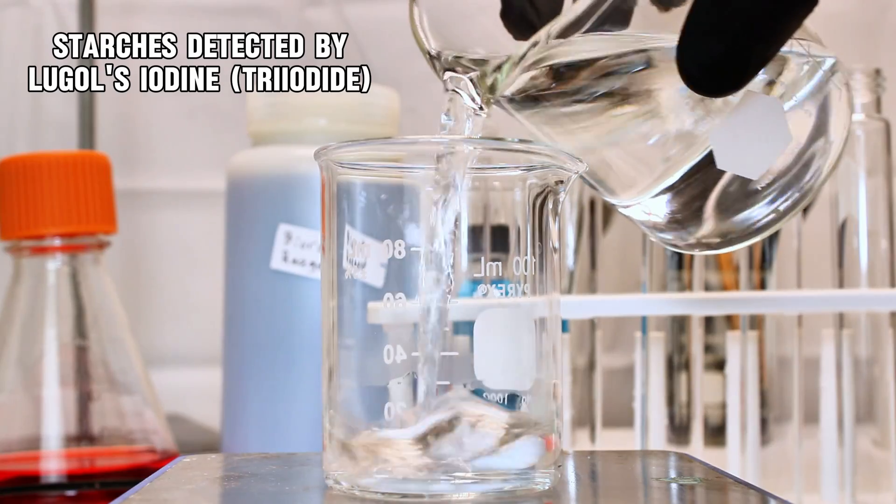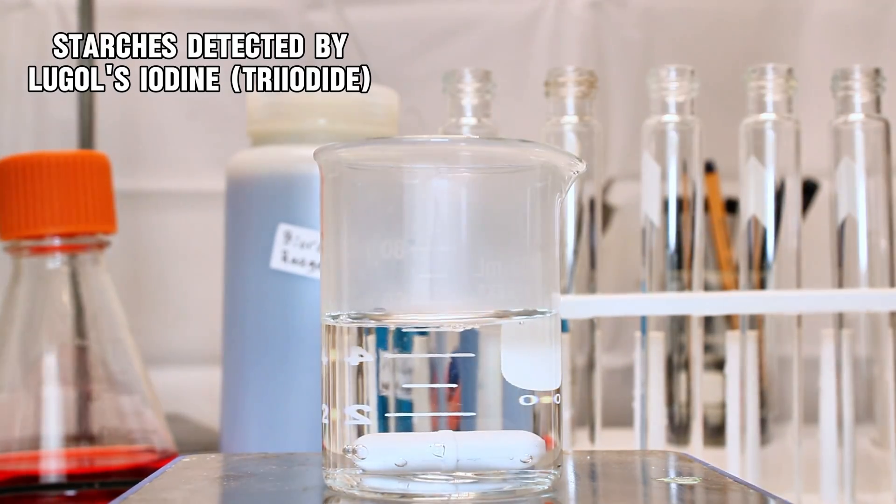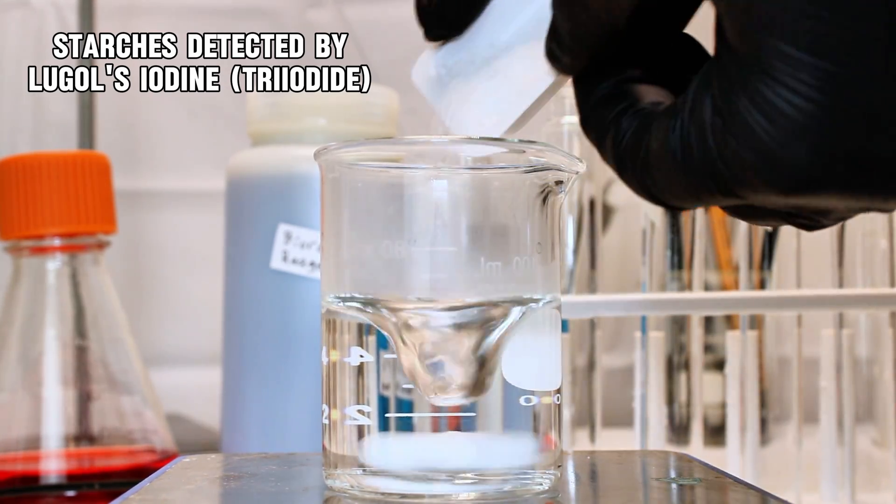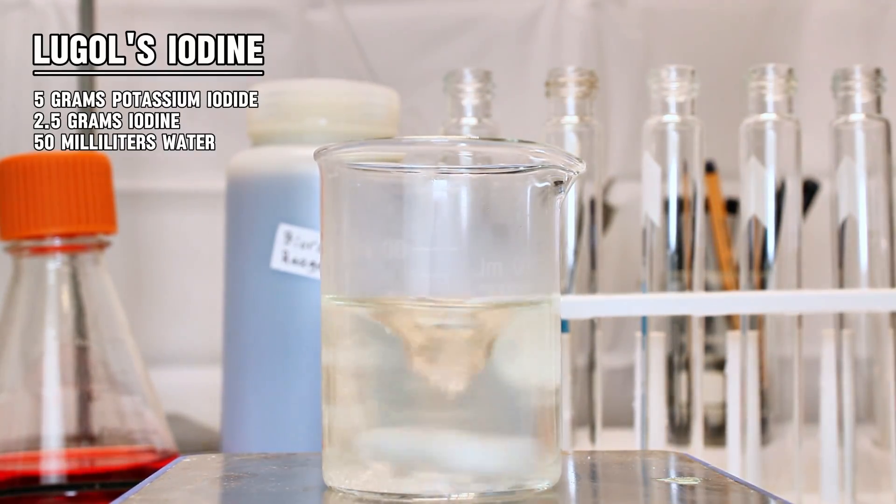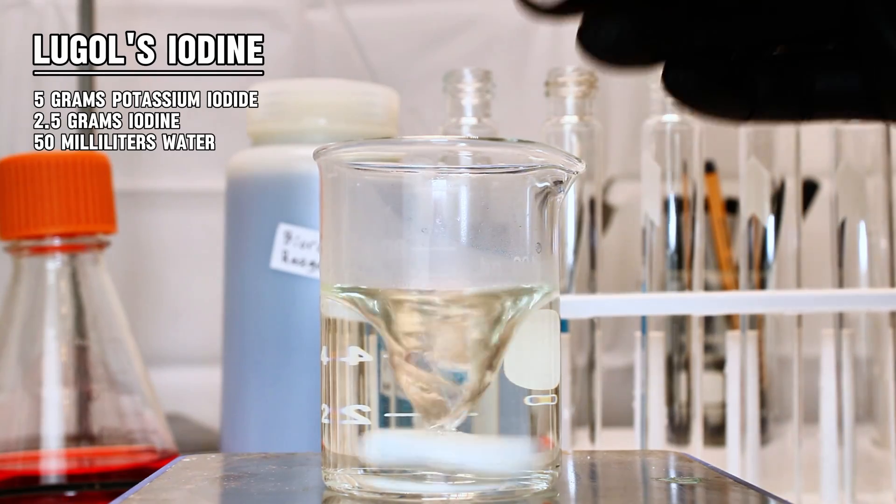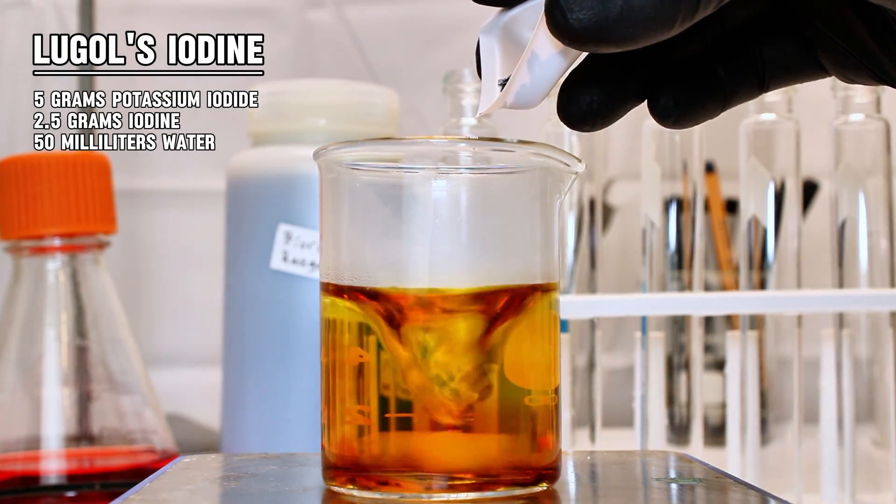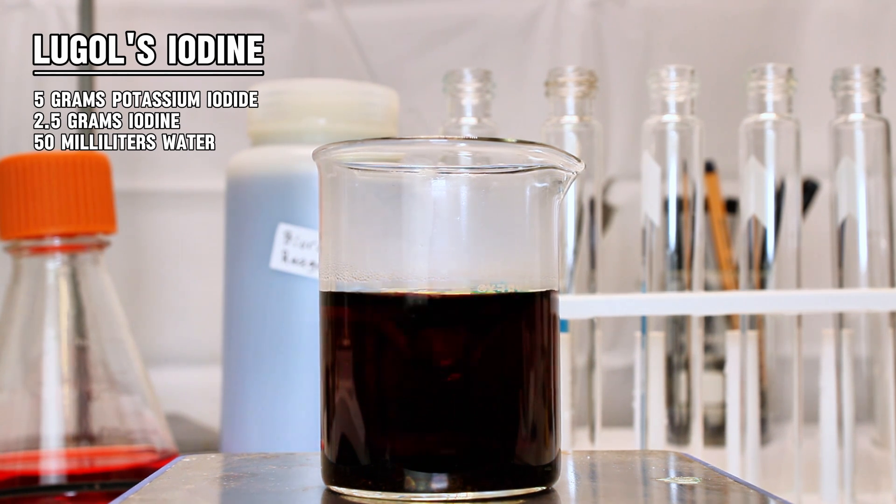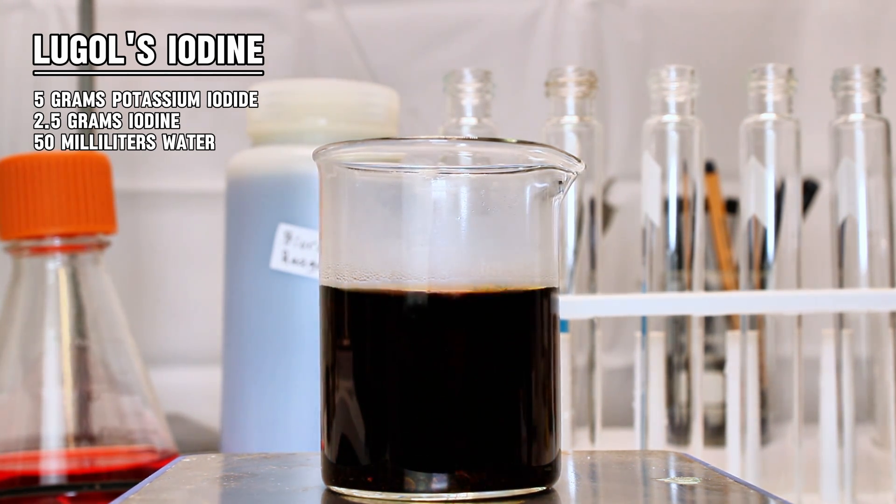For my second reagent, I need something that can test for the presence of starches, and by far the best is something called Lugol's iodine. To make this solution, I first dissolve 5 grams of potassium iodide in 50 milliliters of water. Once the potassium iodide had completely dissolved, I then added 2.5 grams of elemental iodine, and gently heated the solution until it all dissolved as well.